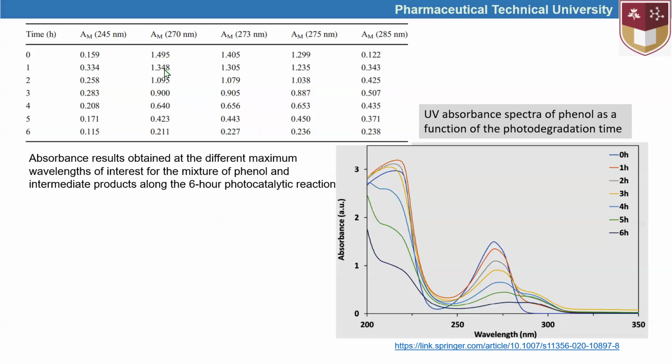Here we can see a linear lowering tendency from 1.495 to 0.2.